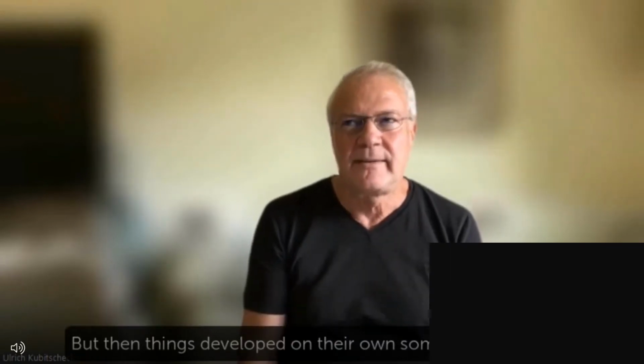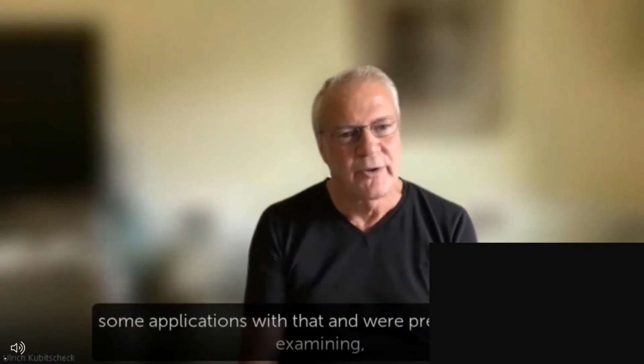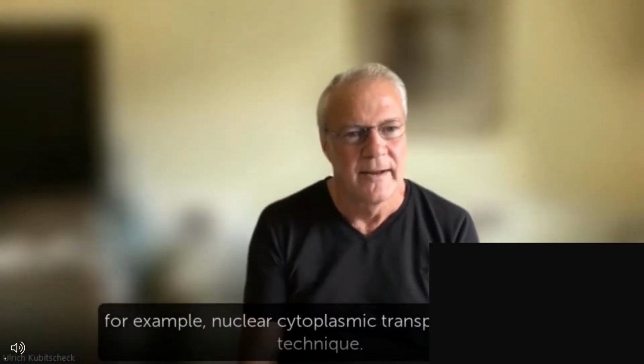But then things developed on their own somehow. So we did some applications with that and were pretty successful examining, for example, nucleocytoplasmic transport using that technique.